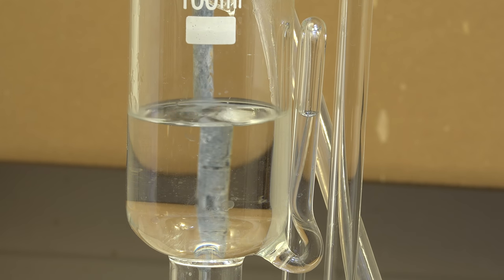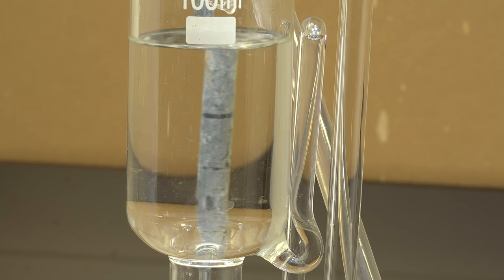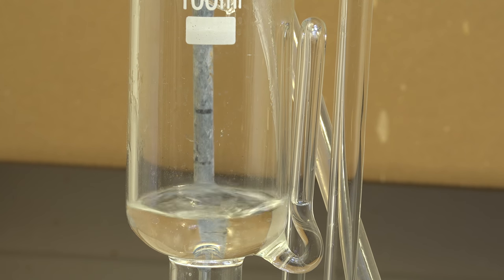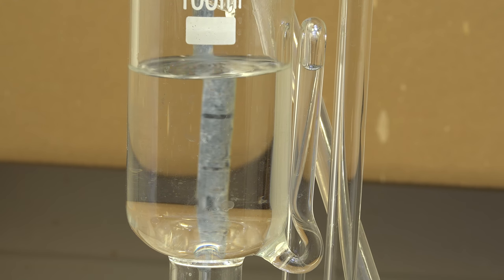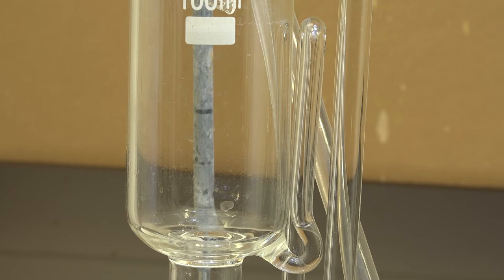Now the Soxhlet extractor is extensively used to separate and analyze the components in food and other natural products. It can be used to analyze fats, extract essential oils. You can even use it to clean things by placing them in the body and having the solvent wash over it. Almost every chemical glassware supplier sells a Soxhlet extractor.